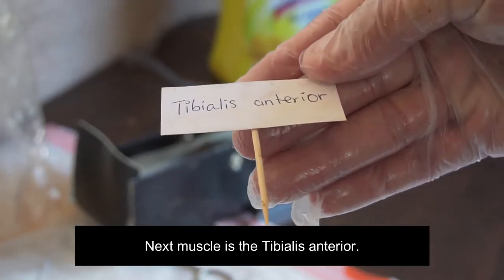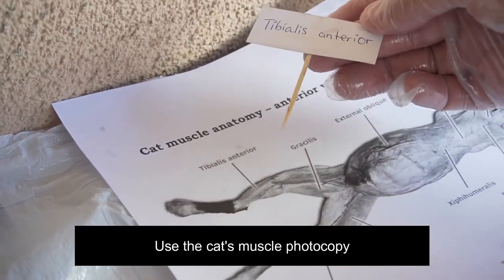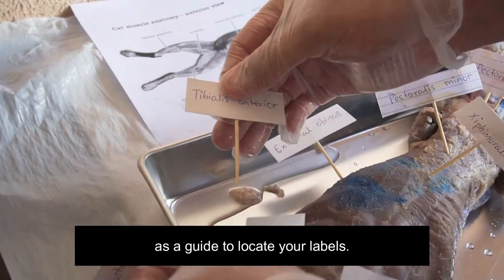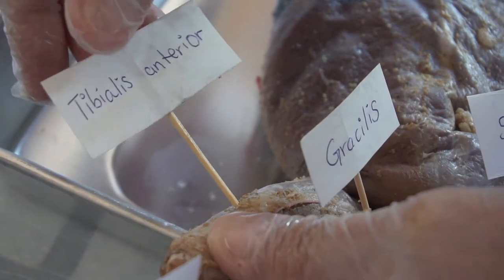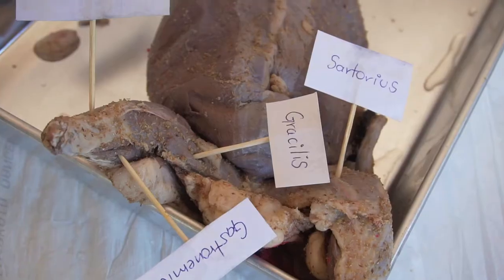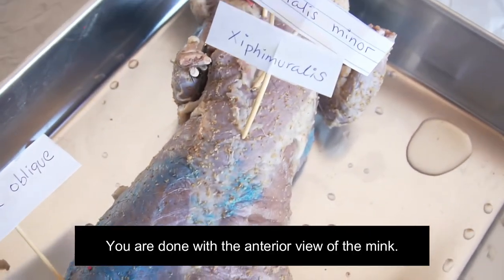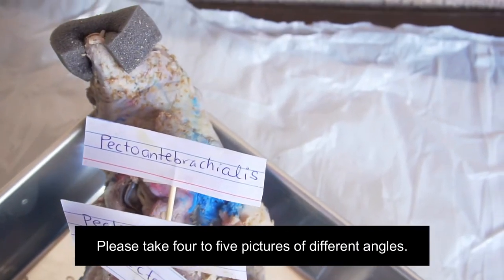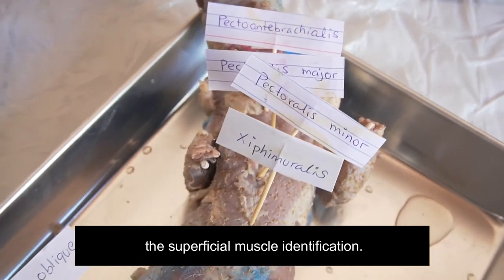Next muscle is the tibialis anterior. Use the muscle photocopy as a guide to locate your labels. Good job. Keep trying. Great job. You are done with the anterior view of the mink. Please take 4 to 5 pictures of different angles so I can see how you did the superficial muscle identification.